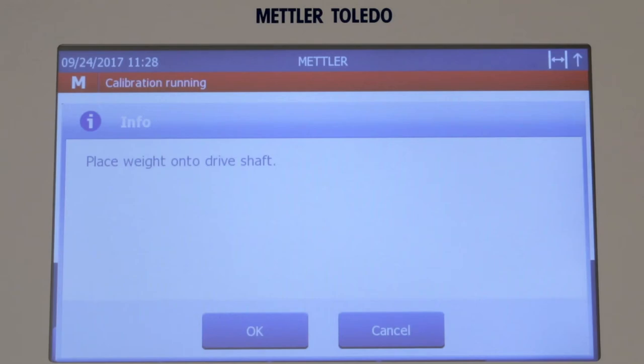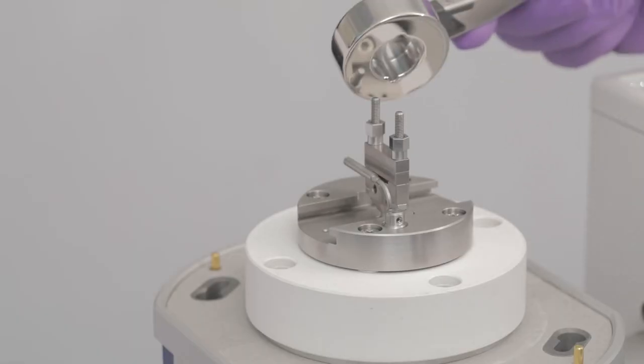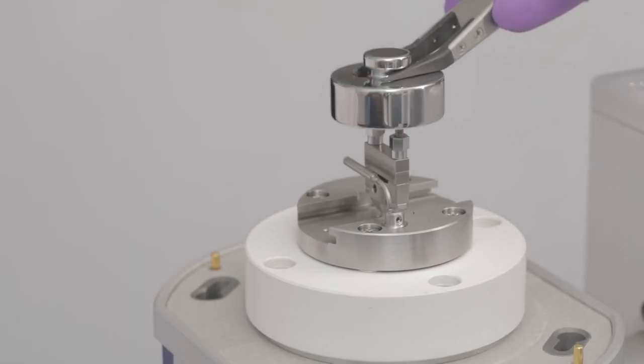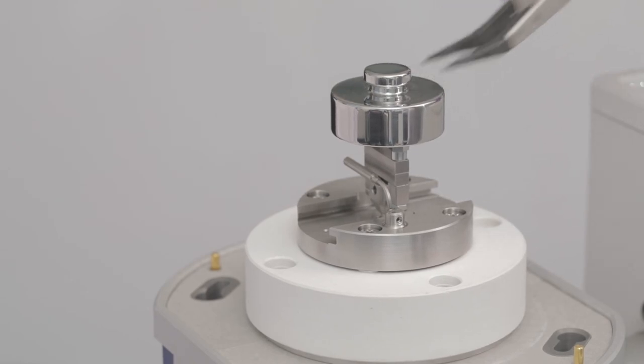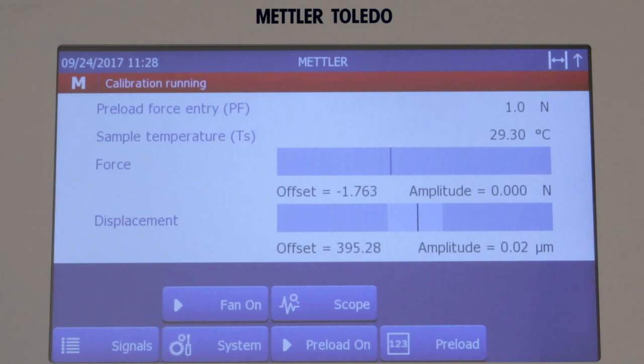Fit the reference weight on the driveshaft. The two support pillars fit into the two recesses at the underside of the reference weight. Tap OK to confirm the proper placement of the reference weight. Both the static and dynamic force factor parameters are now calculated.